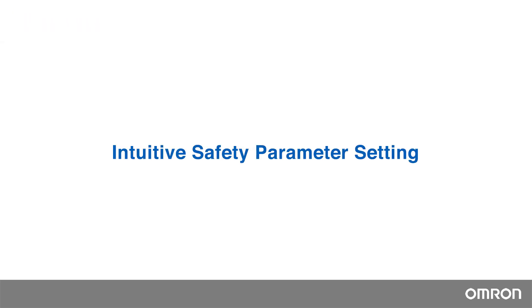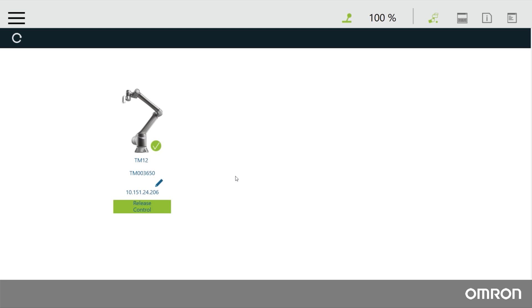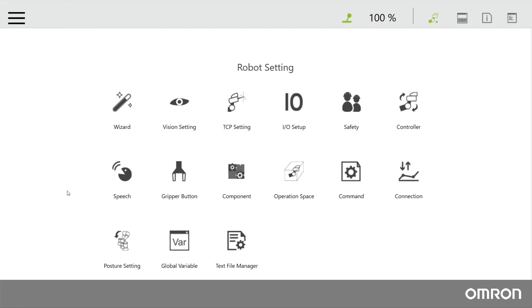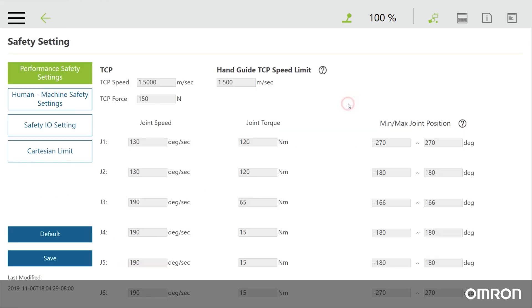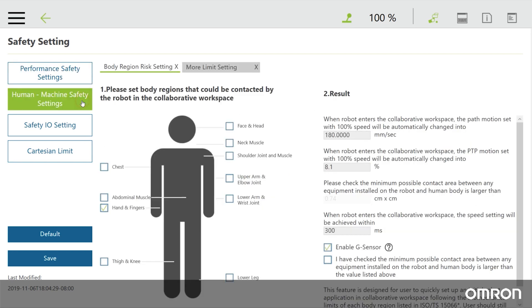OMRON's Collaborative Robot software is called TMFlow. TMFlow allows users to adjust a range of parameters in order to reduce the risks involved with implementing an application. These include limiting the speed, torque, force, and position of the joint and TCP in order to reduce risk of injury. Since there are many numbers involved, the safety parameter setting can be a bit overwhelming, but the OMRON TM robots have a graphical user interface to help you through this process.